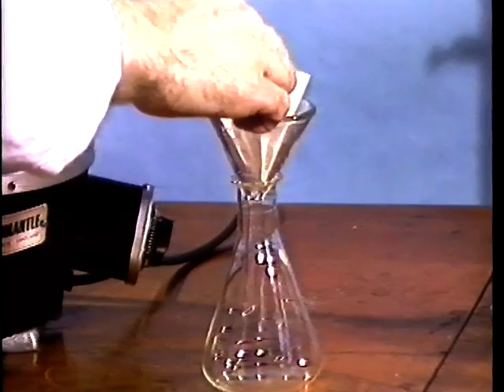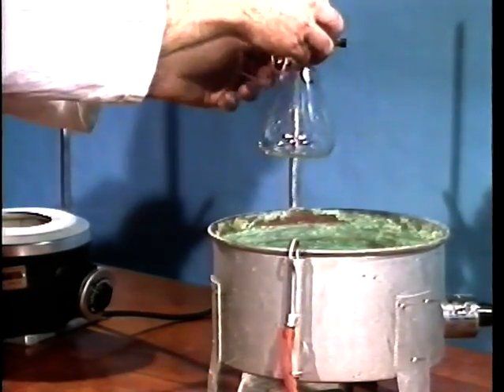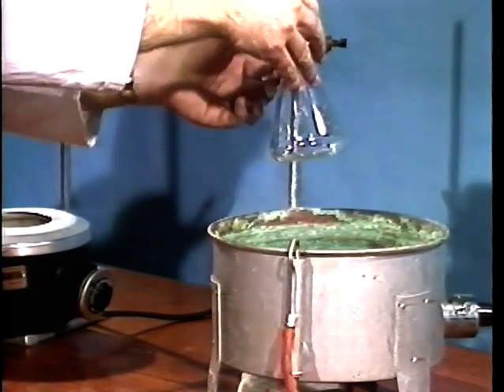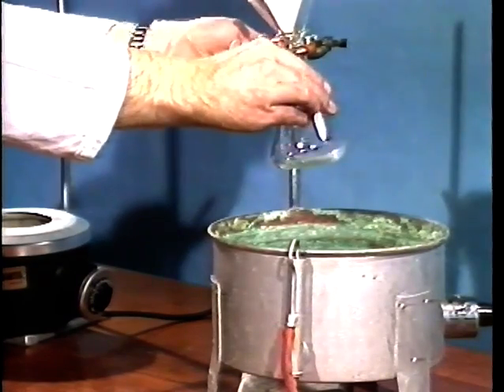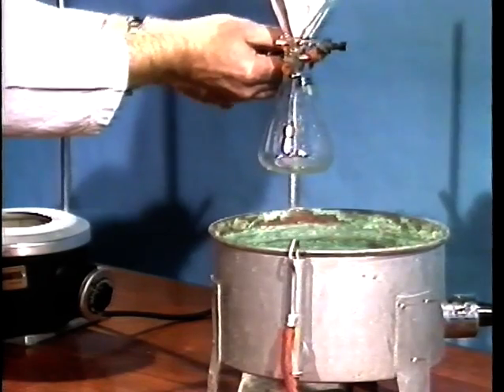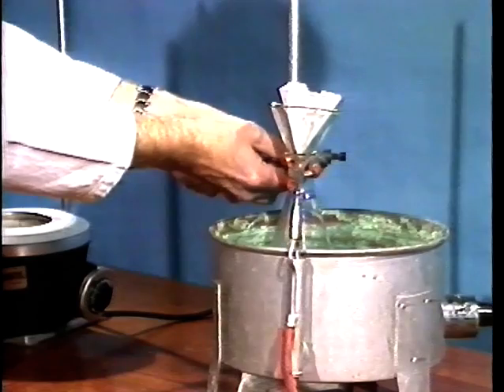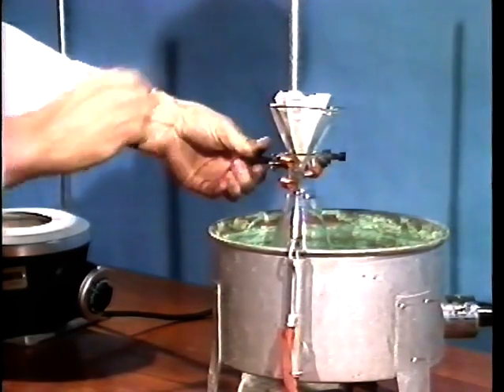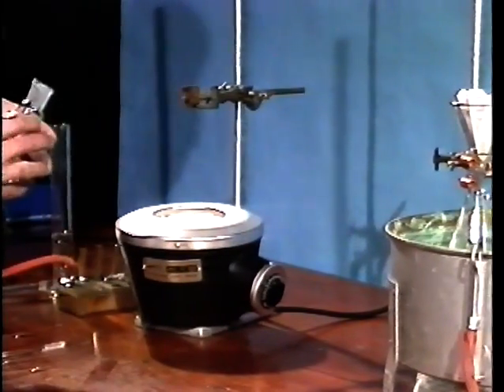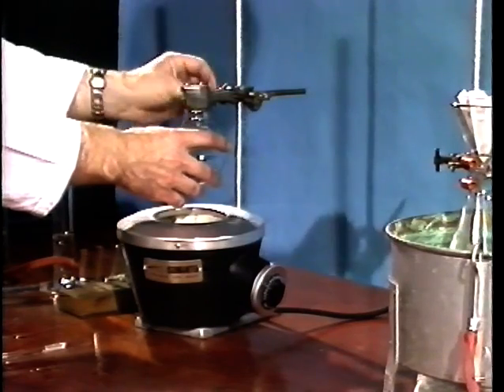Place the fluted filter paper in a gravity funnel which has been pre-warmed in an oven. Put the funnel into the neck of an Erlenmeyer flask and clamp the whole apparatus in a hot water bath in order to keep it warm. Set up your recrystallization apparatus as before.